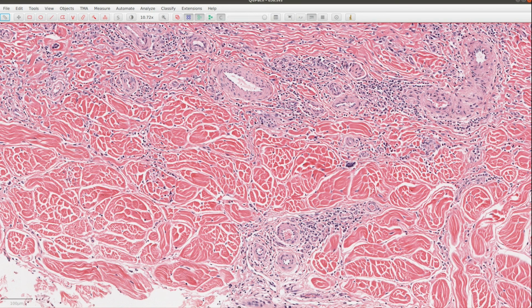I hope you're all clued up on how to spot blood vessels on histology slides now. But there are still some pitfalls. Why don't you check out this quick video about some structures you might confuse with blood vessels and how to avoid those traps.